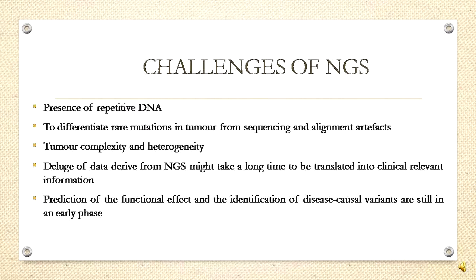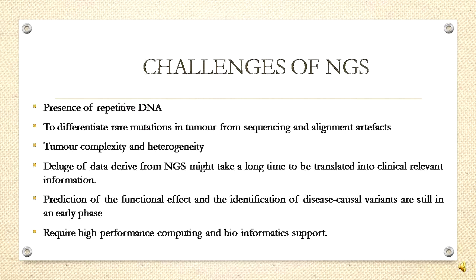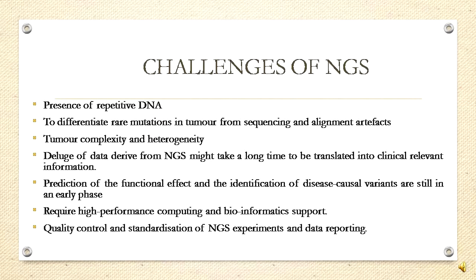To perform the next generation sequencing, they require high performance computing with the support of bioinformatics. They also require quality control and standardization of experiments as well as the data reporting.